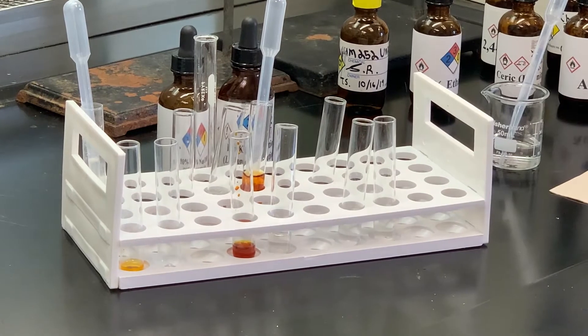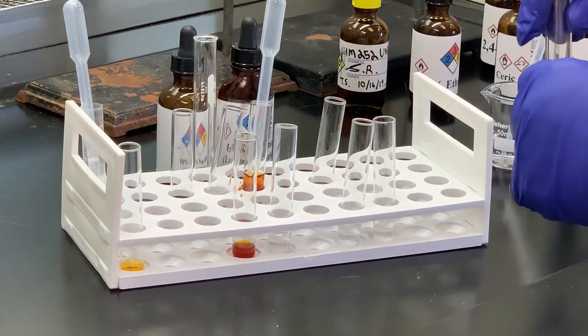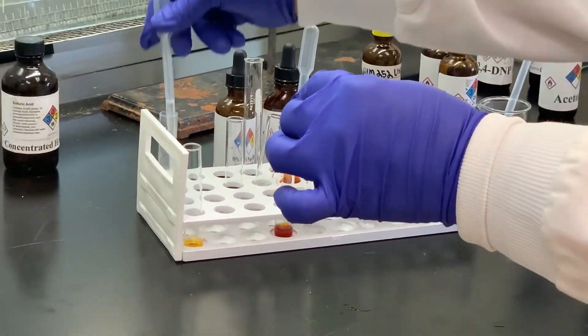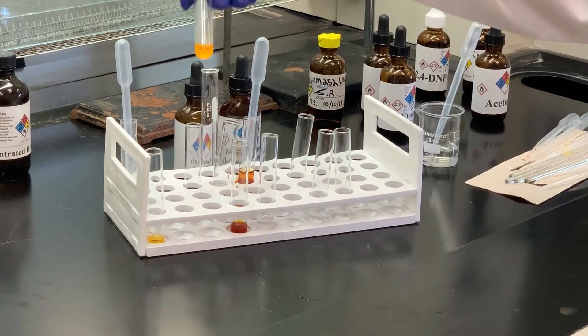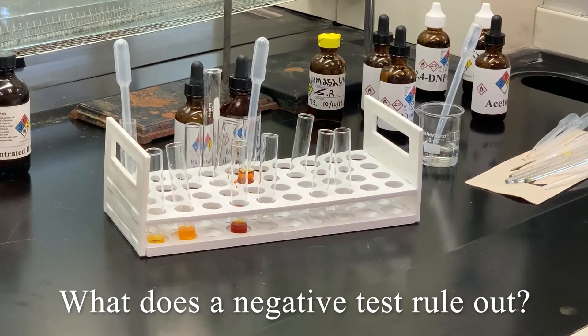We've narrowed down the possible classes, so the first test we're going to do after solubility is the ceric nitrate test. I'm going to take some of the ceric nitrate solution, add a few drops of my unknown, and see if anything happens. We're not seeing any red color — it still has kind of the same color. So we would say that is a negative test for the ceric nitrate.